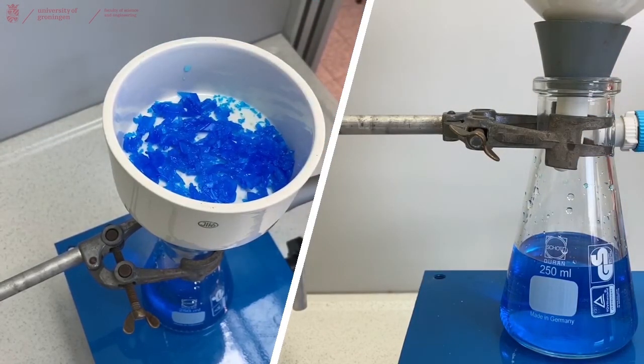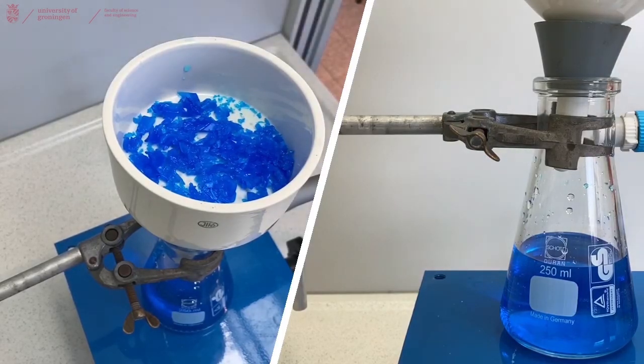When your crystals are dry, you can continue with the rest of your experiment and analyze them for purity and melting point. This is how you perform a vacuum filtration.